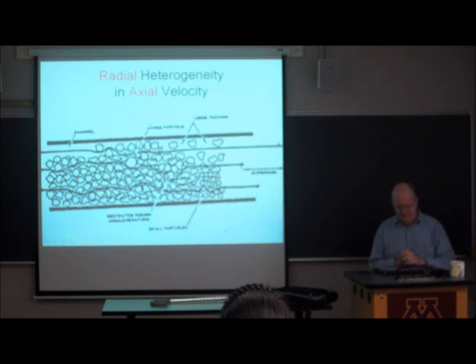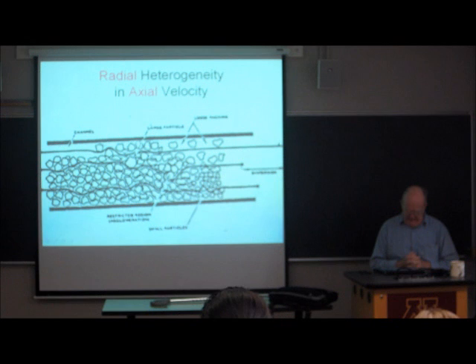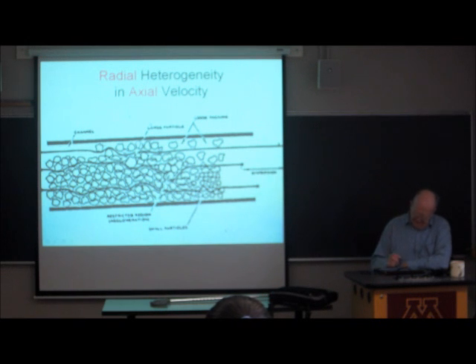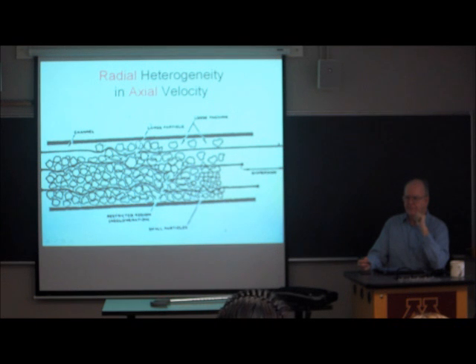Now let's take a look at a packed column. I didn't have the patience to draw all those particles, so I copied this. And it's not quite exactly as I would have drawn it, but it'll do. The point is that there's no way to pack a tube uniformly with particles.